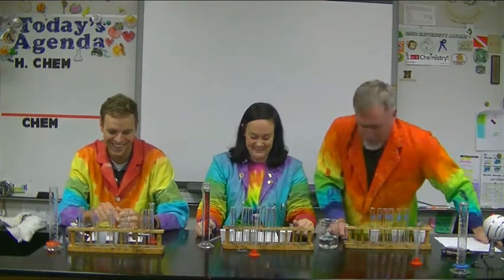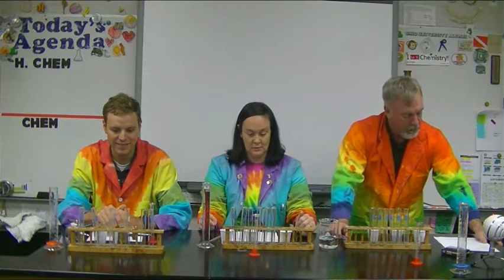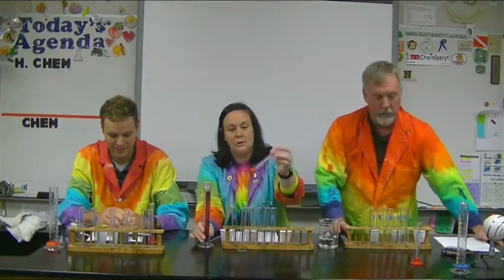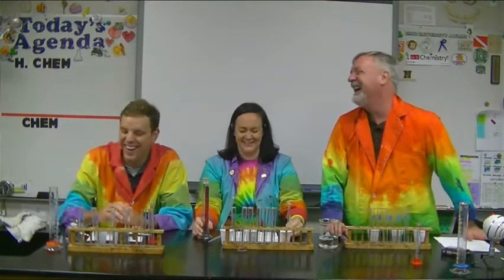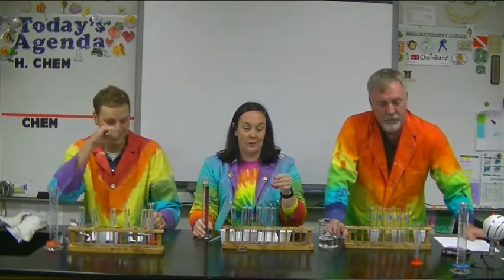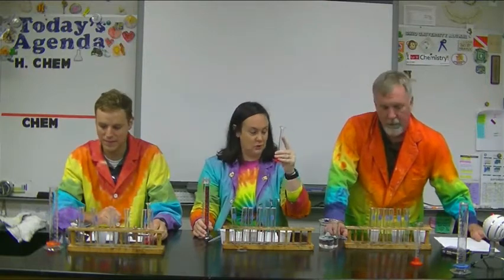All right. Next step. Now we've got that. It looks like we're supposed to put 13 milliliters of our red solution into test tube A. Which one of these would you use for 13 milliliters? This only goes to 10, but this goes to 100. What I would probably do is fill this up to 10, and then get 3 more in the same one. Agreed?